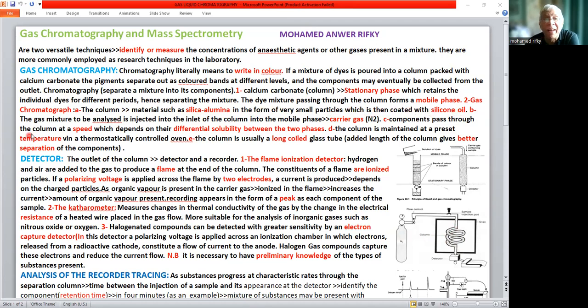Second, the mixture being analyzed is injected into a port in the system, where the mobile phase carries this mixture through a flow meter to the supportive media, which is made of a long glass coil to improve the proper separation of the constituents of this mixture.